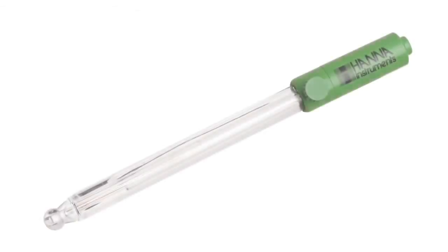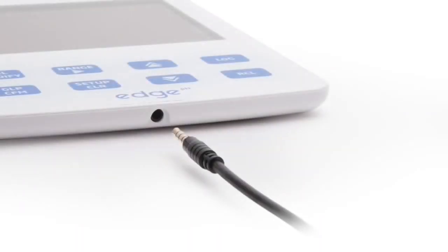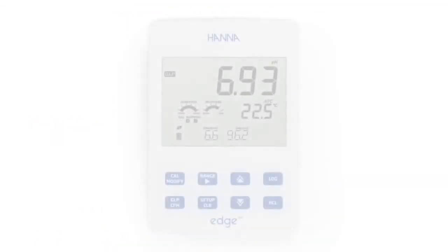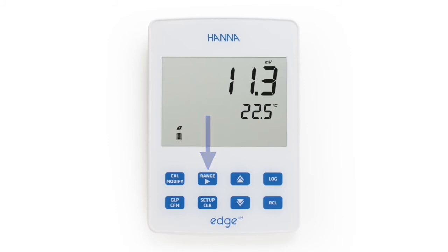The HI11310 is a digital pH electrode with a built-in temperature sensor that connects to edge via a 3.5 millimeter connector. The resolution of the pH range is selectable up to 0.001 and is extremely accurate. Calibration can be performed up to five points with a choice of seven memorized buffers and two custom buffers. Switching between pH and millivolt mode is made easy by simply pressing the range button while in measurement mode.